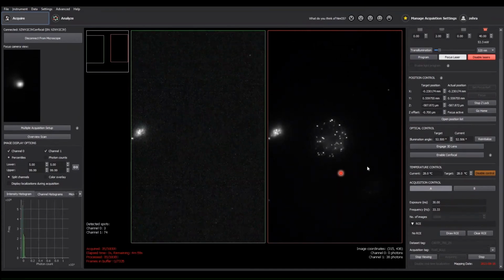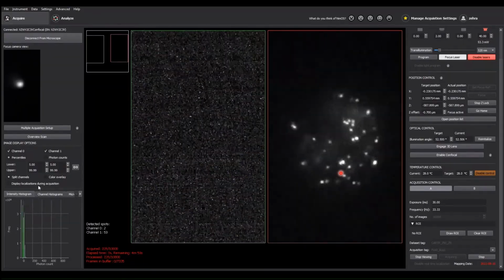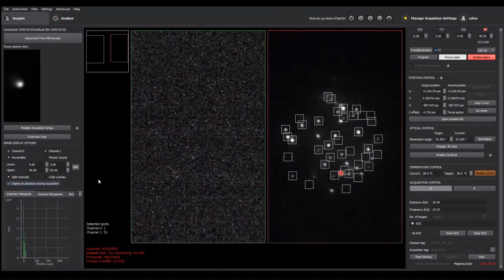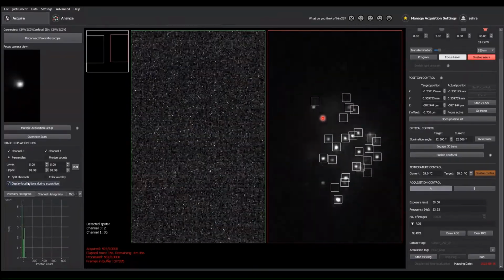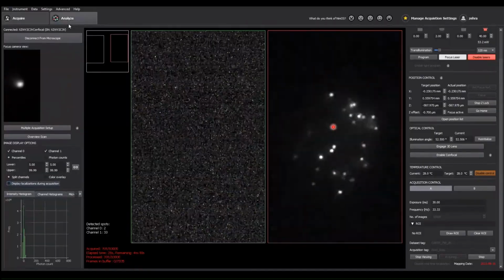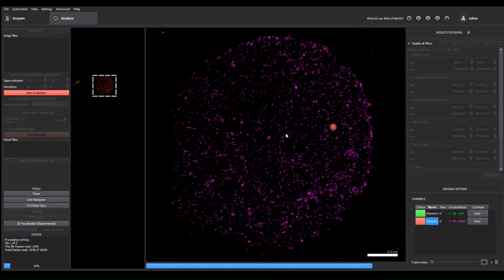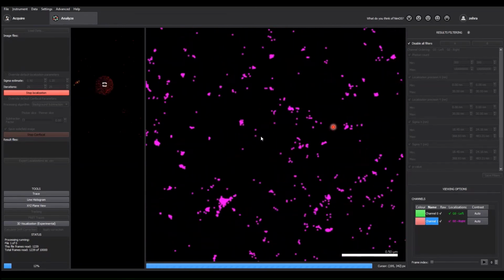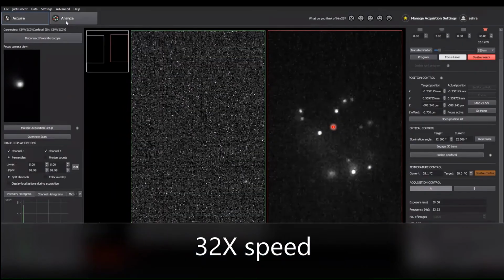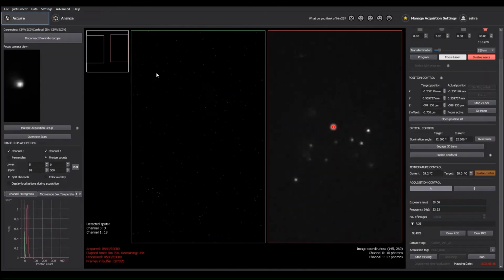the molecules, each of the fluorescent molecules, to report back their position by appearing temporally separated in time as blinking events. And then our localization algorithm can find the center point of each of these spots and mark that computationally to build up the image over time, rather than get a blank sheet of light back from all the molecules that are crowded in space. You get individual molecule positions denoted from this random distribution of blinking events that report back the position of each molecule.